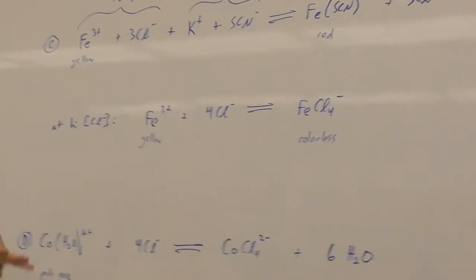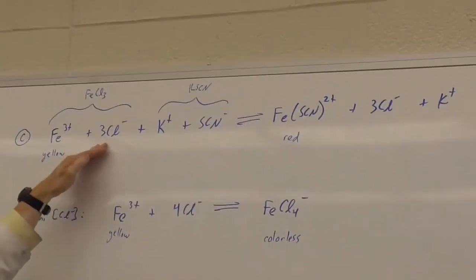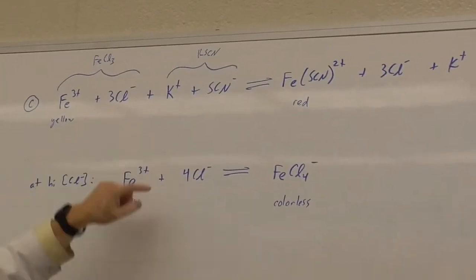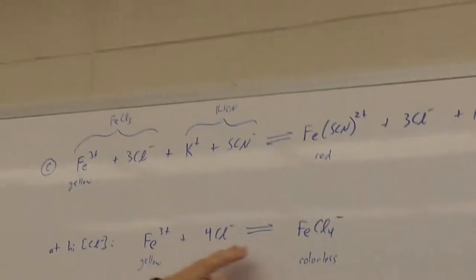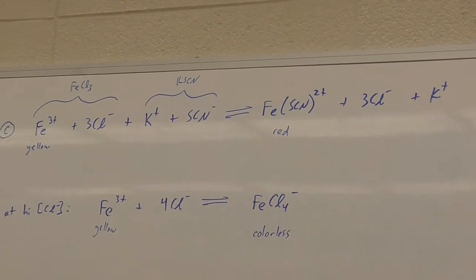So we potentially have 2 reactions happening. This one's definitely going to be reacting even at low concentrations. If we get that chloride up high enough, then this will also start to react and occur in our solution. So let's go give this a try.